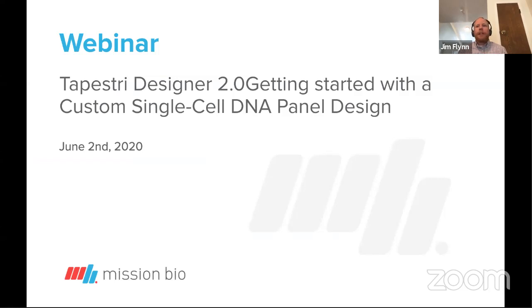So this software really is simple to use, and what you can do is you can begin to ask biological questions which are relevant to your cancer research, or if you have a CRISPR model system. It allows you to completely customize the targets that you want to go after.